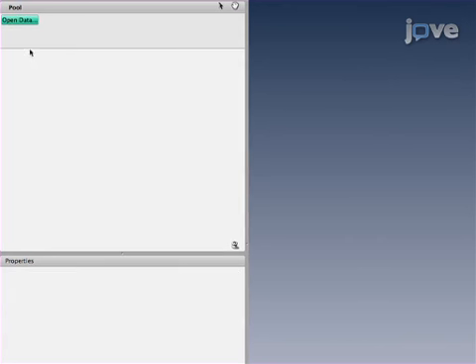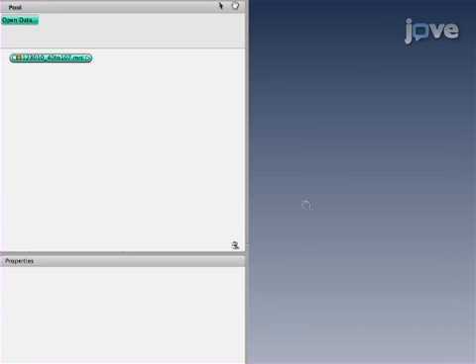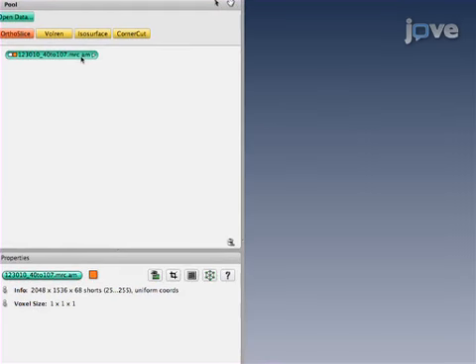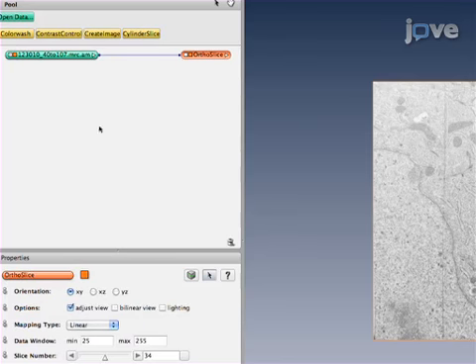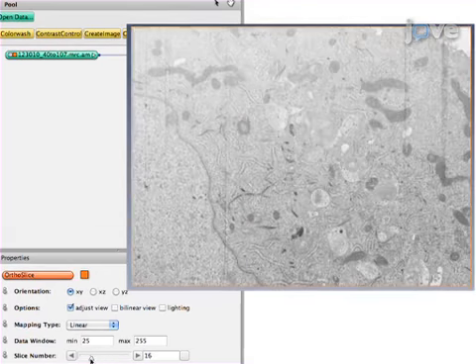For 3D image sequence, select Open Data and select filename.tiff or filename.mrc. Then toggle, right-click, and select Save as filename.am. In 3D Viewer window, select OrthoSlice to open the image file. Then use a slider at the bottom to navigate through the slices.